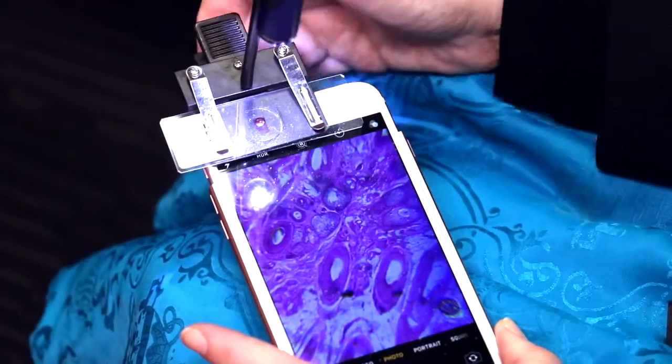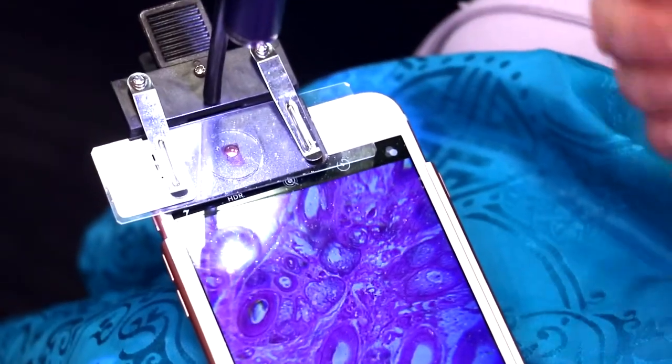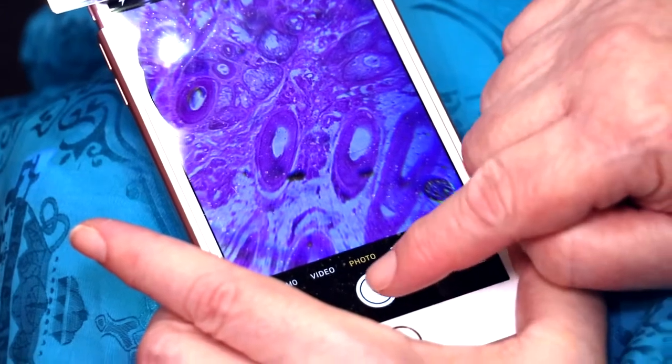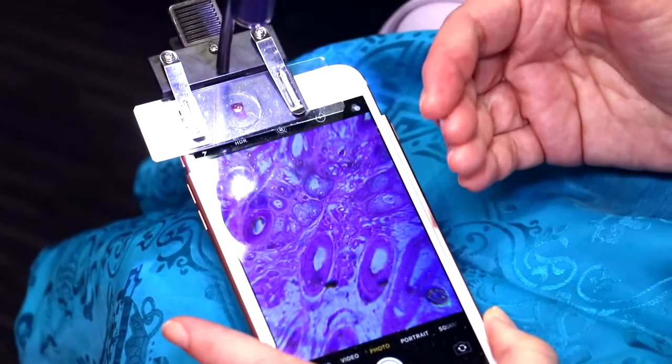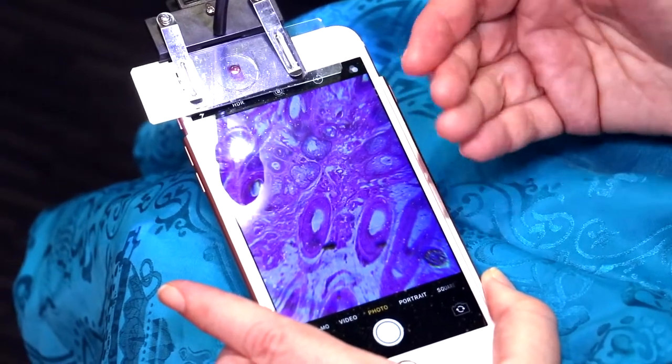When I do that, I'm lining it up, and it lets you see directly the cells themselves. There's no need to focus — it auto-focuses. And you can take a picture. If a child is doing it, you and the child can view it at the same time. There's no need to look down a tube.